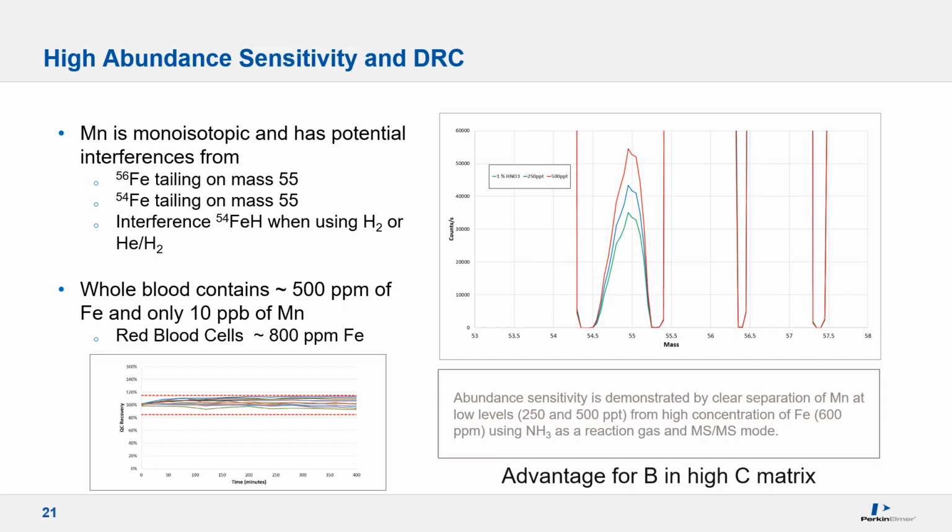And that is one aspect. It also would need to control the interferences which can happen at the target mass, in that we talk about reaction chemistry in the cell. So it's the dynamic reaction cell which comes into play here. So there's two aspects.